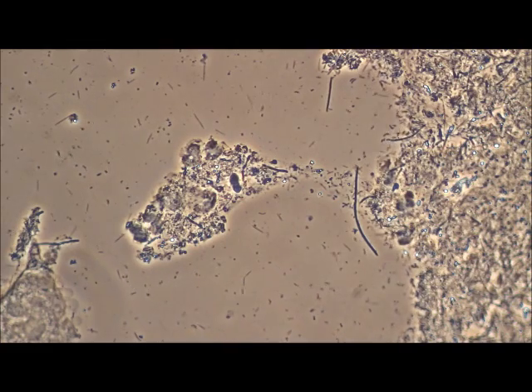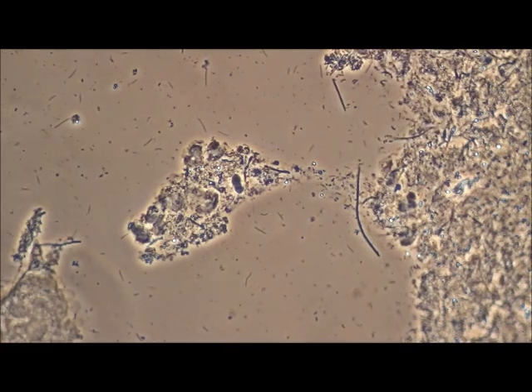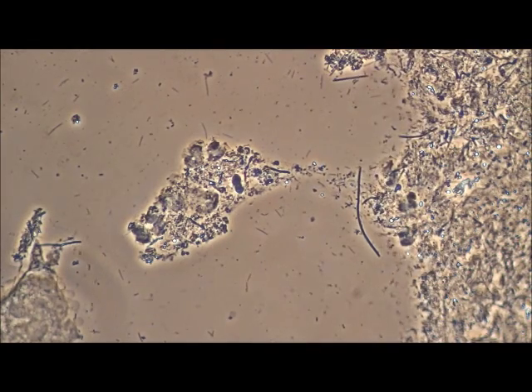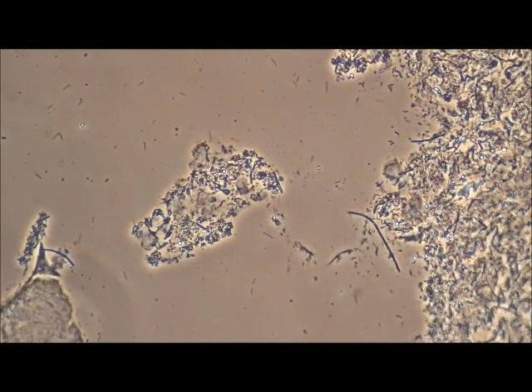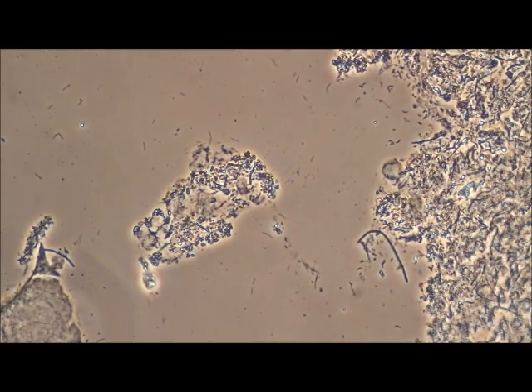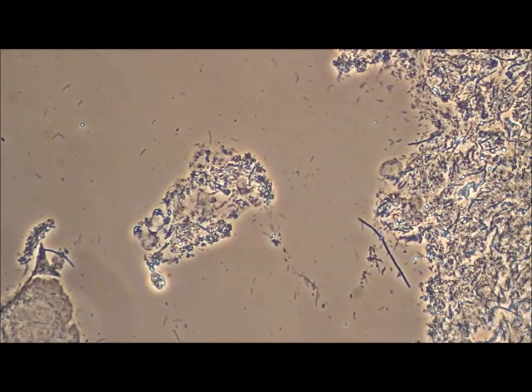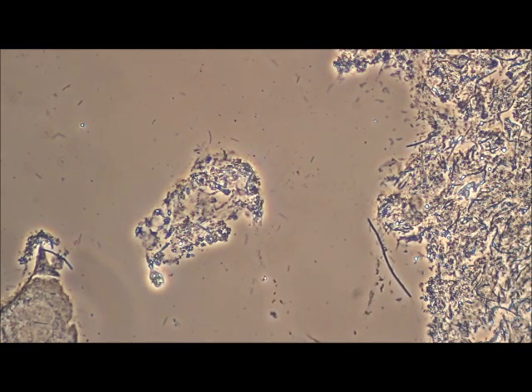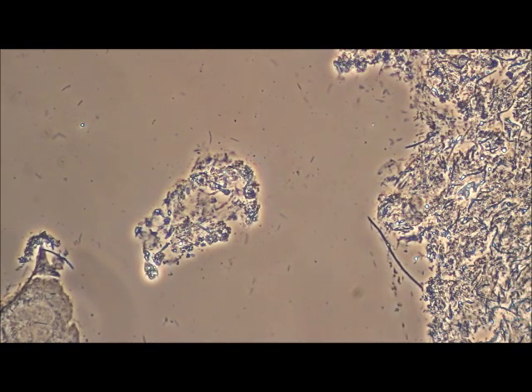As it comes across the slide from left to right, it's going to be killing this bacteria. There it goes, right there. Basically, as soon as that solution hits the area where the bacteria is, it instantly kills this bacteria. It's fast, it's quick, and it's basically 100% kill.